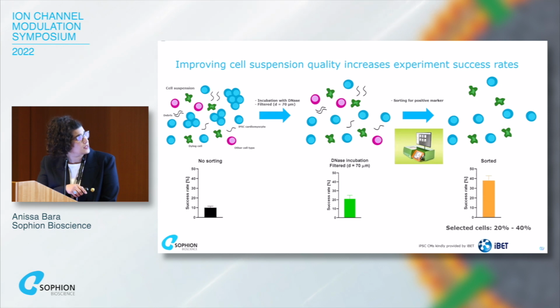And you can see here that after using the cell sorter that very specifically targets the cell type that we want to work with on our APC machine, we are getting rid of most of the other cells. Of course, we still end up with some dead cells, but it's nothing compared with the first cell suspension that we get before cell sorting.